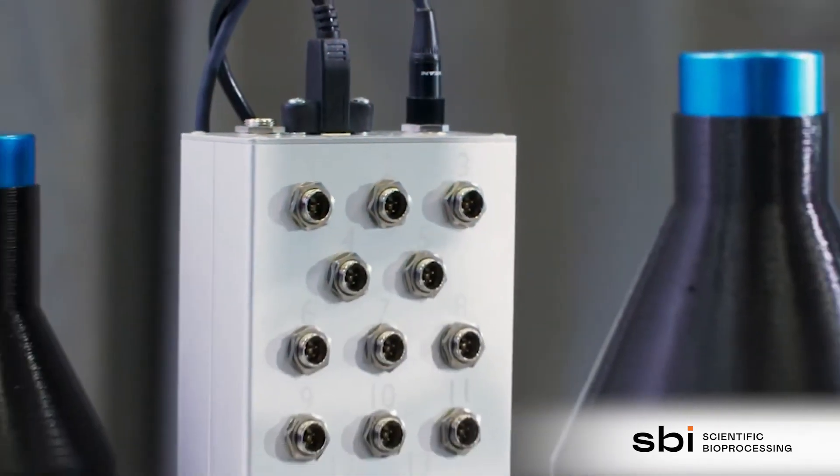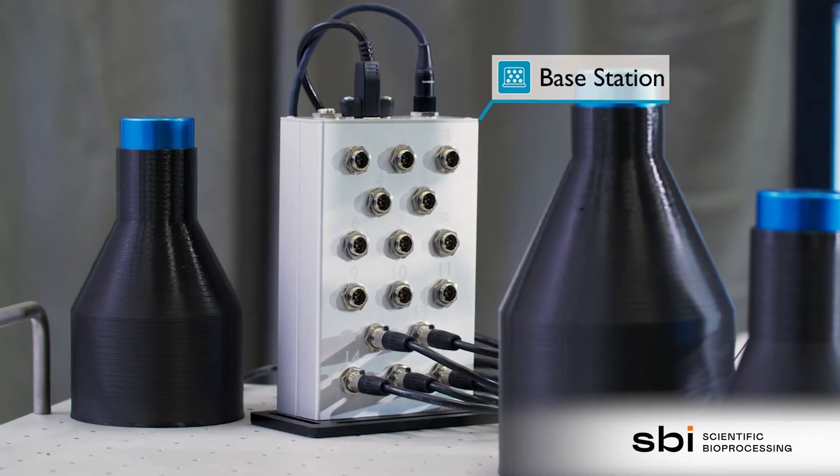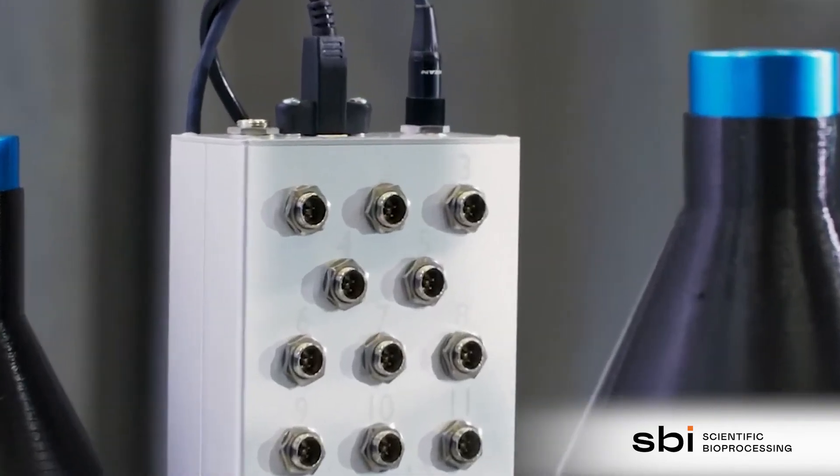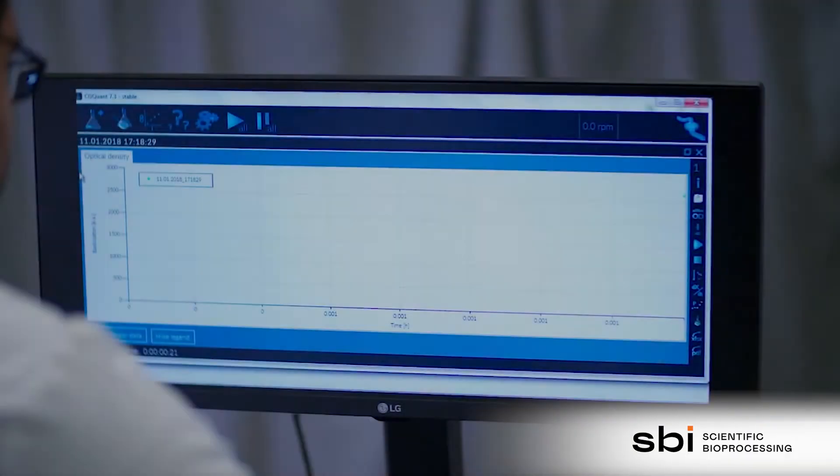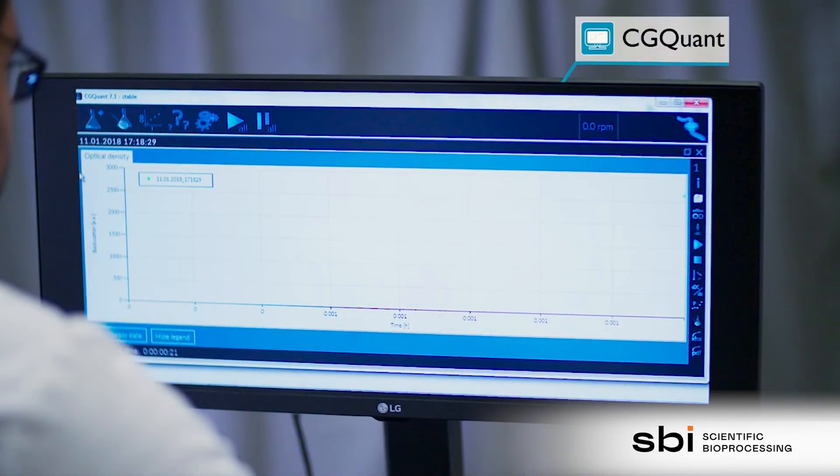The CGQ base station collects the measurement data from all connected sensors and sends it to the CGQ software. The software analyzes and visualizes the data of all sensors.